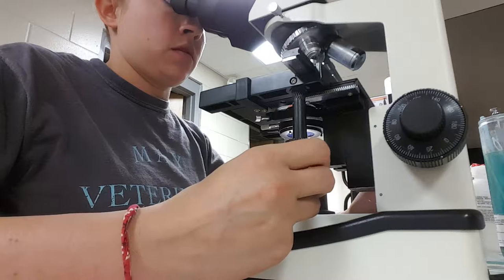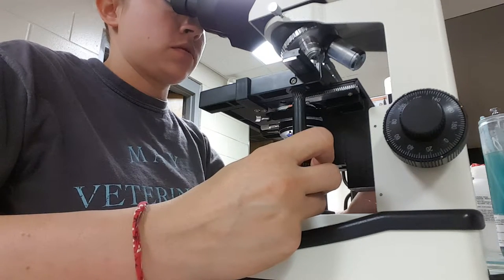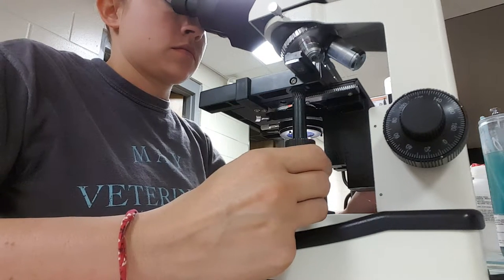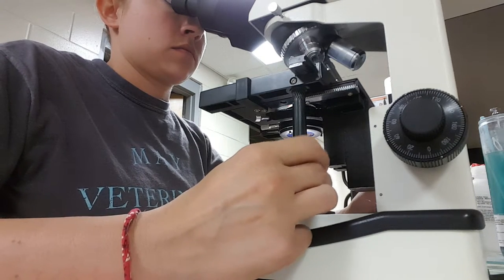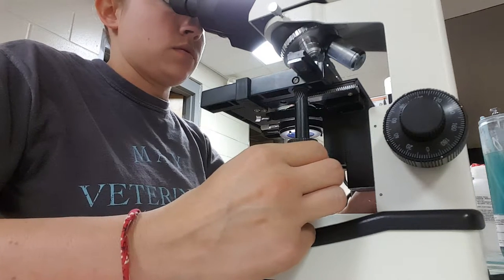This dog is in the middle of heartworm treatment, so I don't know if I'll see any or if I won't. So I'm just going to scan slowly throughout the whole slide.